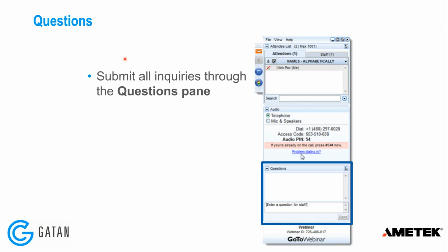Related to that, I also want to point out that there's free offline software available on the Gatan website. Since so many people are currently working at home and don't have access to the laboratories, we have created a version of GMS 3.4.1 for offline analysis that includes the full analytical suite. It'll run for a limited time, but it gives everybody a chance to use this exact version of the software on their home computer, even without a license. We'll follow up with an email to the group on how to download that version. We're still working out a couple of things on the download site to make sure it works correctly.